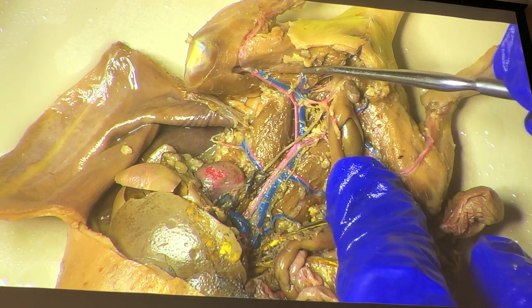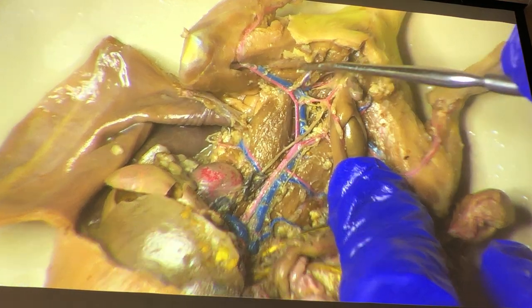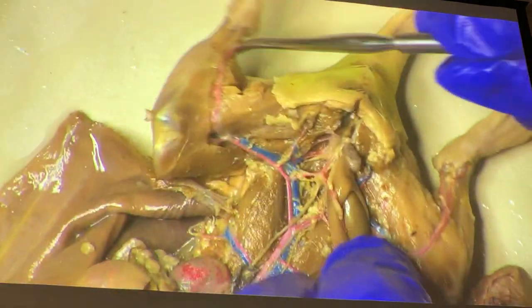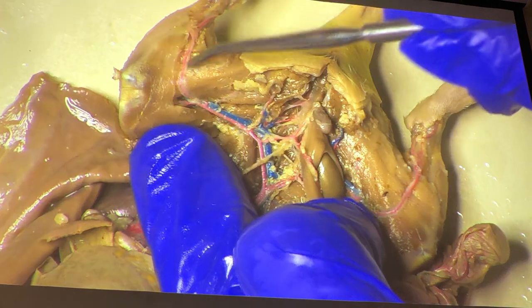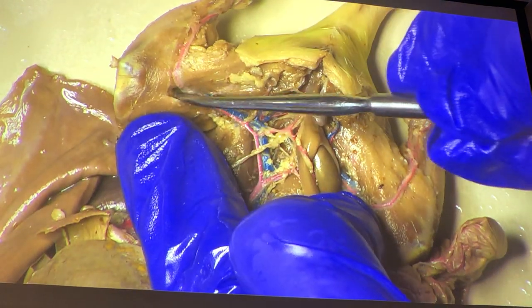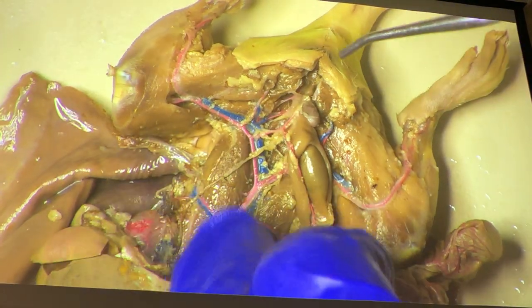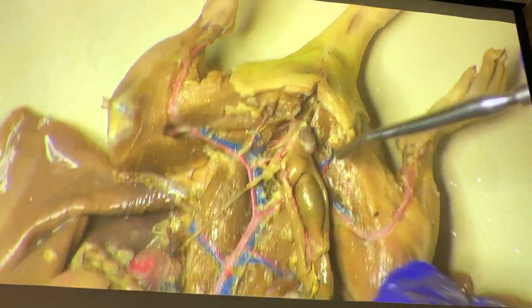This is a muscular tributary — you don't need to know the name of that. Then femoral, saphenous, and popliteal. Pretty nice actually, good job.